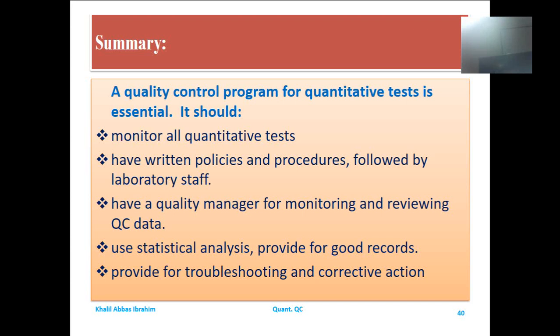Never regard any quantitative process in the laboratory as inessential. No, you need to target all the procedures of quantitative examinations in the laboratory by your system of quality control, and it should have written policies and procedures before starting to apply the procedure.